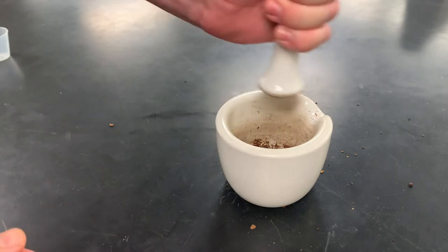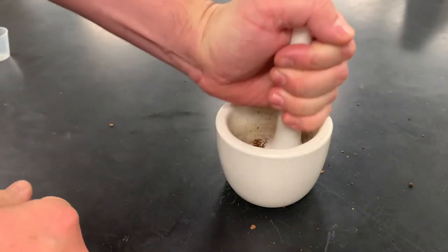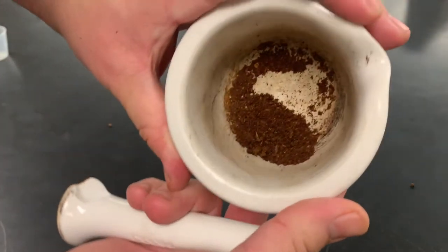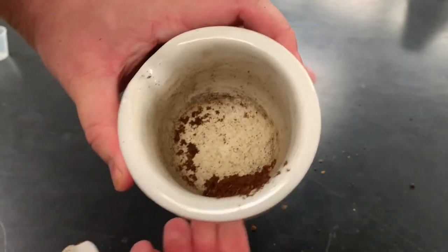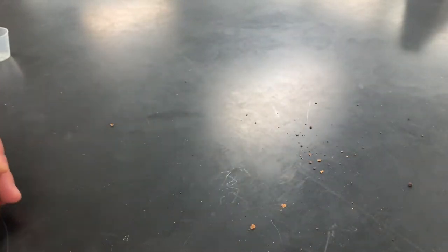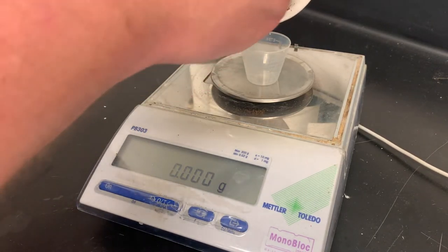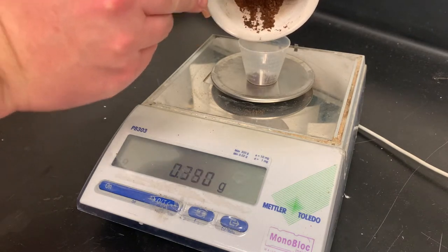Notice I am grinding it. I'm not banging it. You don't want to bang it, just send it in. You want to grind it in. Okay, and you can see here we have a relatively good small grind. That'll be good enough. And now we're back to here, and now we want to actually be a little more precise with how much we take. Also, this stuff smells amazing.